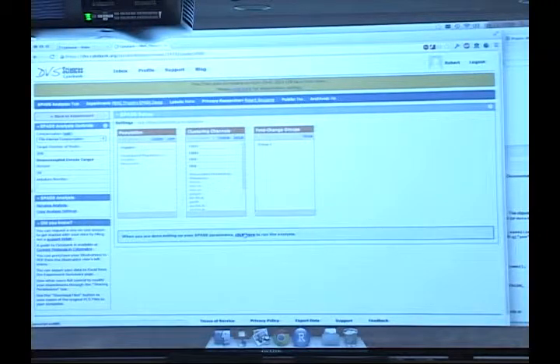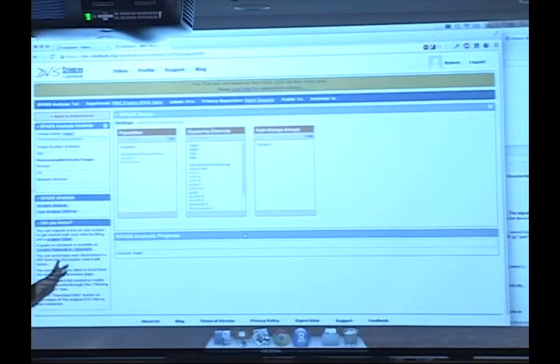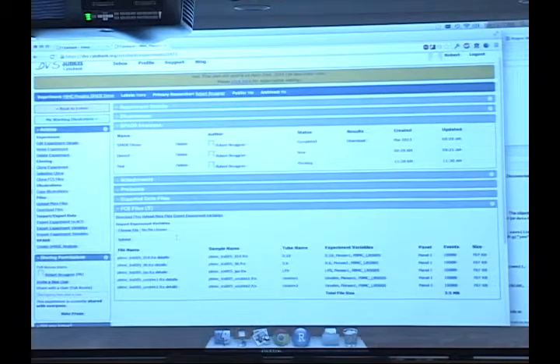So that's basically it. We've set our parameters. And once you're done, you click Start Analysis, and you'll see this bar that goes off and starts turning green. And eventually you'll get an email that says, hey, you're done. And then you can look at the results. So I've gone ahead and already run this exact same analysis that I showed you how to configure, just for the interest of time.